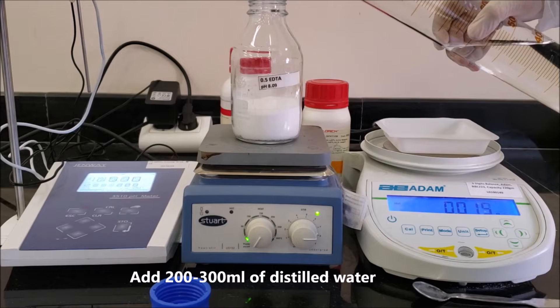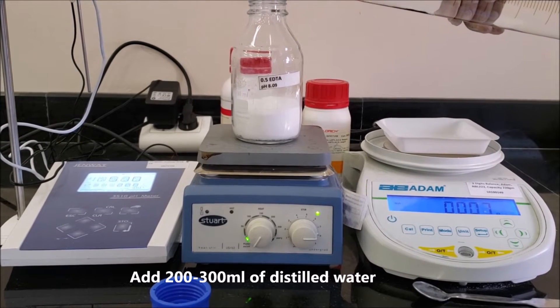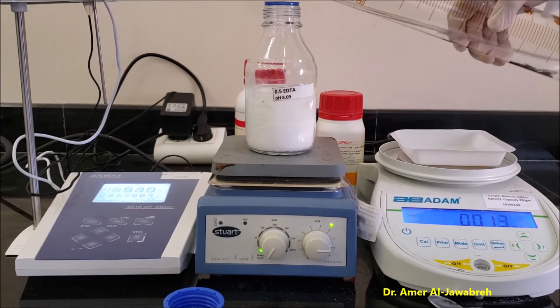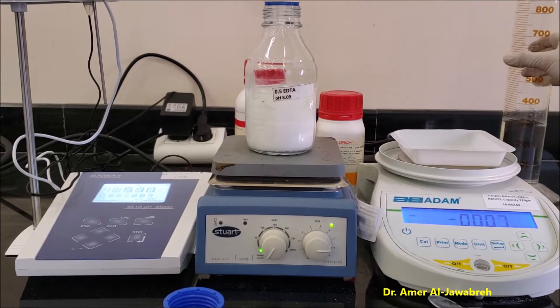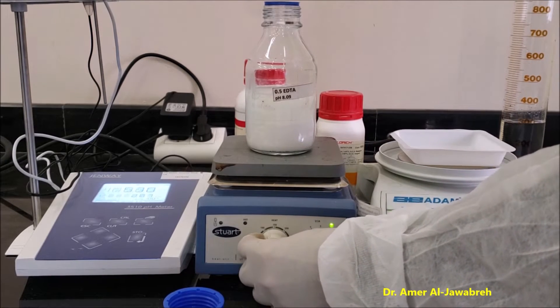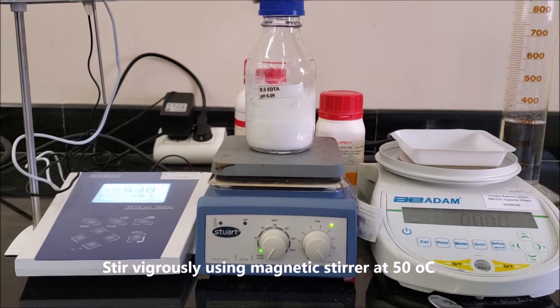Add 200 to 300 ml of distilled water. Stir vigorously using a magnetic stirrer at 50 degrees centigrade.